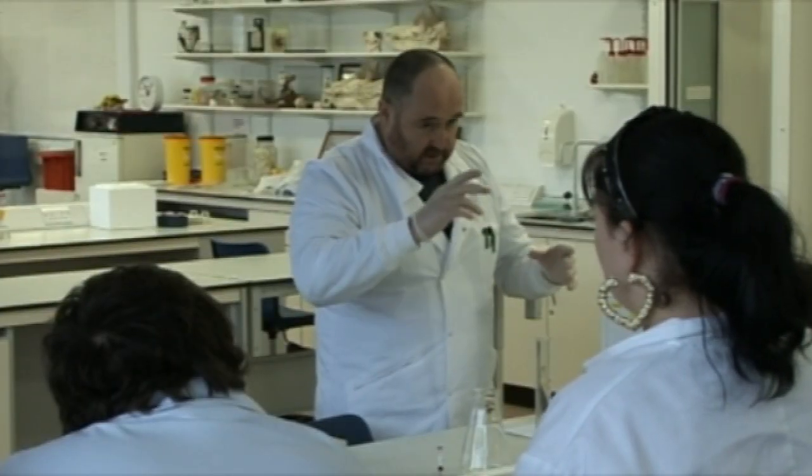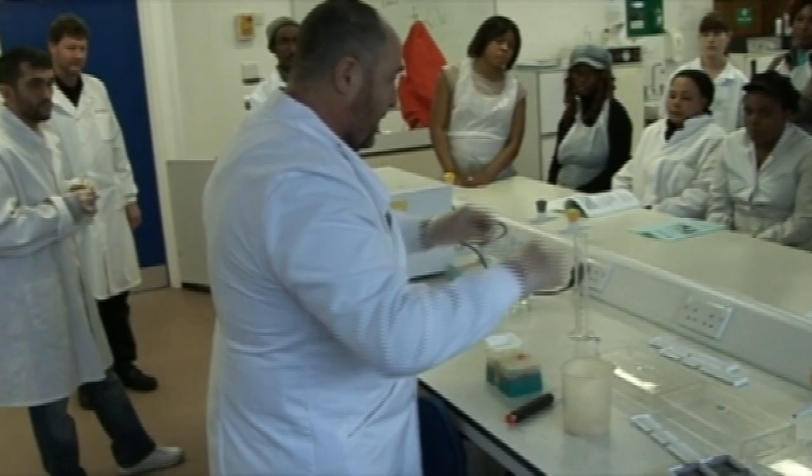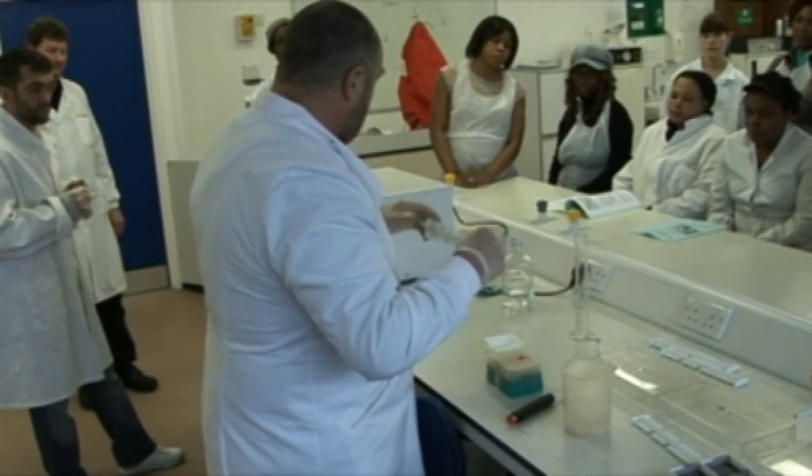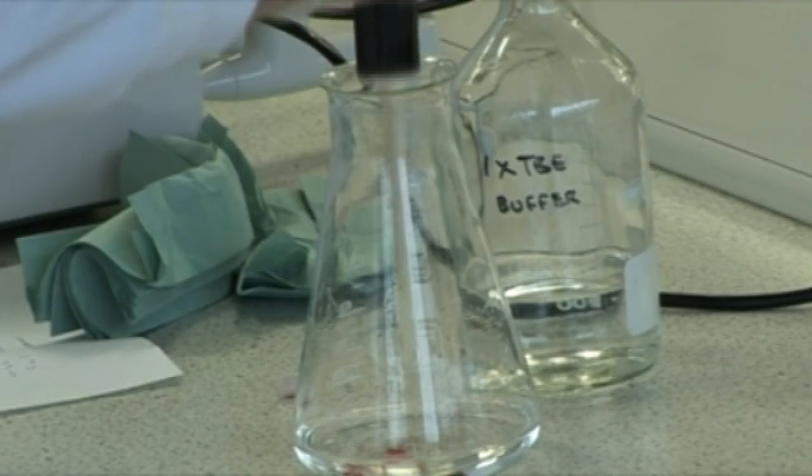We try to give them a good experience of university life as well, so we give them a few lectures to provide some background information. We get them in the laboratory doing a lot of practical work and we also do a few demonstrations — there's some really rather expensive and sophisticated equipment that we show them, just so they can see what kind of things people use in a modern research environment like the one we've got here at Salford University.